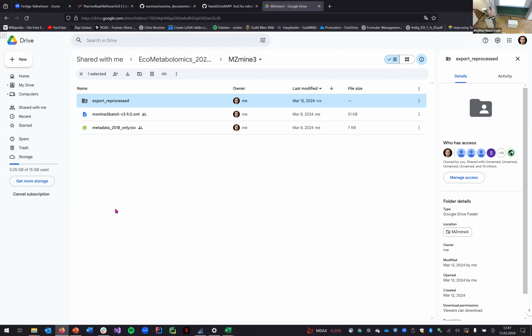I think you save a lot of time in MZmine setting up those features and parameters for your own data, because you can see the chromatograms and mass spectra beautifully there. You can select and visualize, okay, if I put my threshold here, this is what is happening with my data. This is one of the greatest outputs, and you don't have to code anything. That's also incredibly good. I couldn't have said that better.